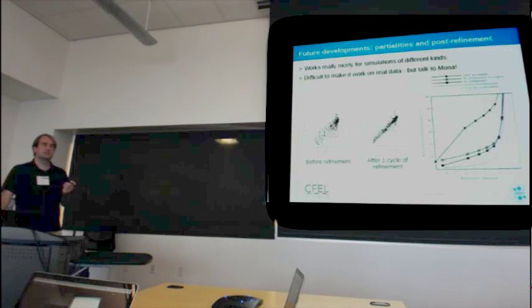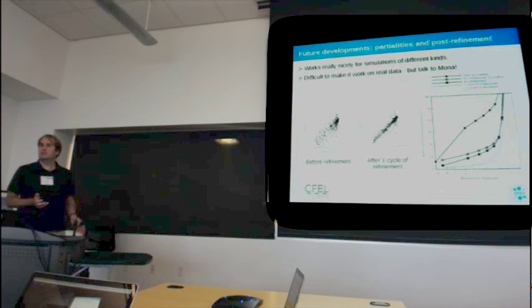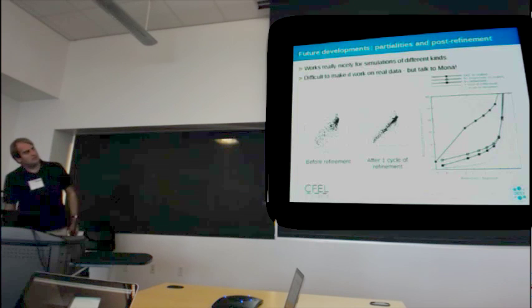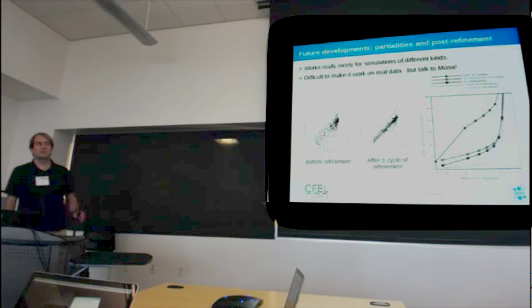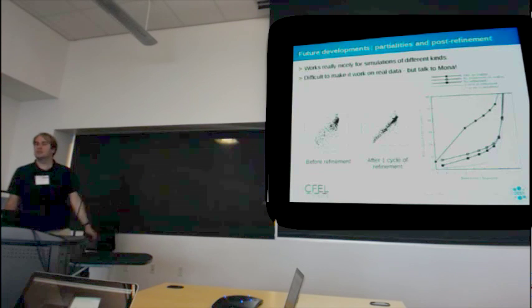Observed partiality is the intensity from the diffraction pattern divided by the full intensity, with the usual scale factor. If this is working, what we should get is a straight line. What we calculate the partiality to be should be exactly what it needs to be. On the left is before refinement, and on the right is after one cycle. You can see they're now concentrated on this line right through the middle. So that shows that it's working.